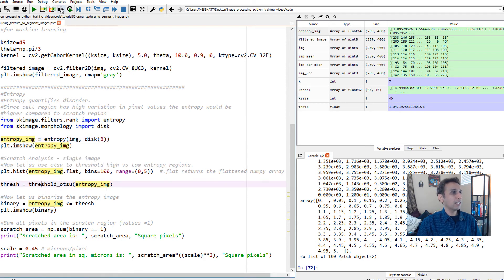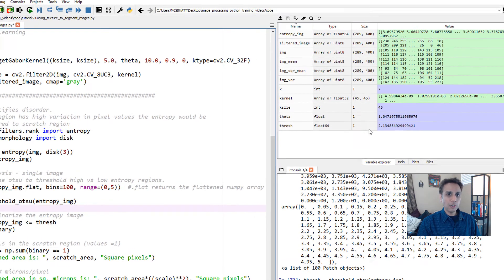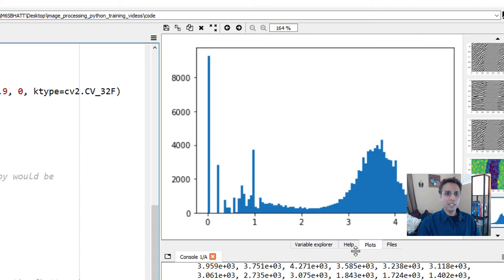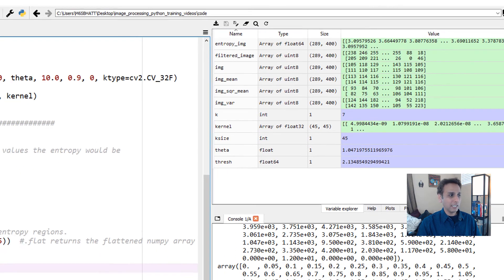Let's apply threshold OTSU onto my entropy image, not on the original image. Let's look at what it tells us. It's telling me the threshold of 2.13. If you go back, I said 2.2. Apparently 2.13, somewhere around here, is a better value to separate these two.